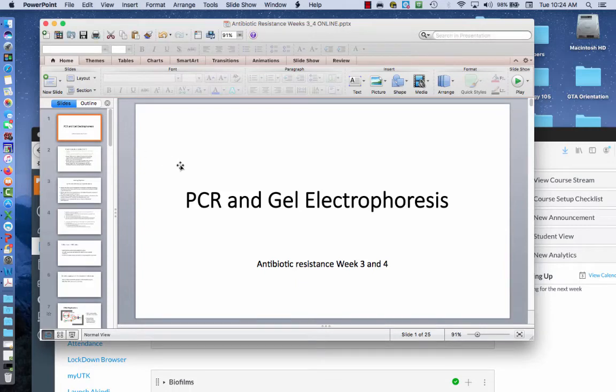All right, so since we are now moving to an online format, we will post this video in lieu of meeting for lab class in person. So we're going to discuss PCR and gel electrophoresis. This is antibiotic resistance week 3 and 4.